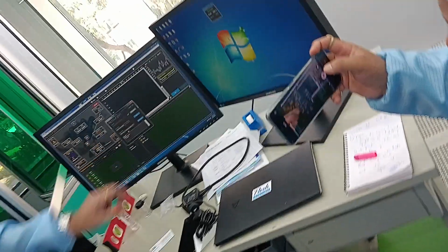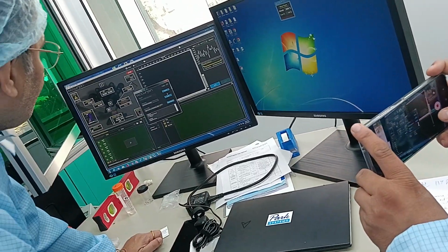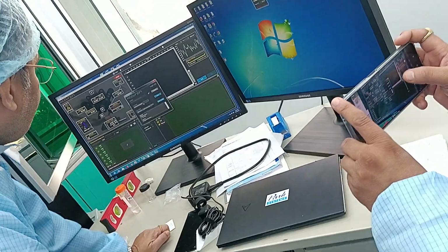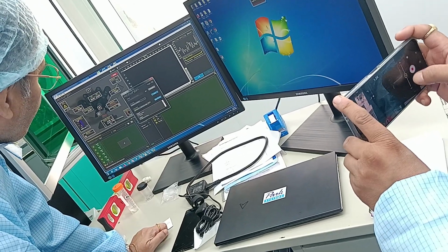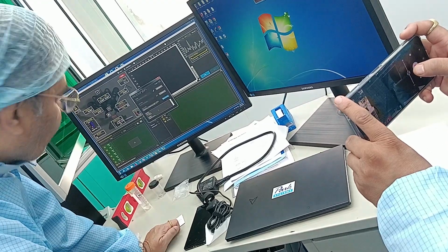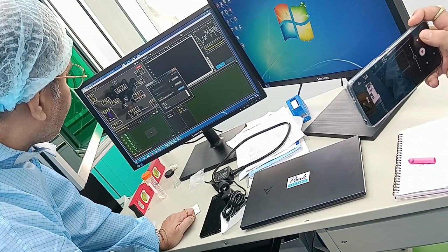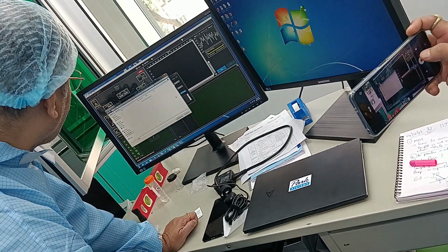Where you have a green module, you just say register. Then here I have given my name because I am operating. So what you have to do is I say login. You give your name, and it will give an area where it is being logged. So I just click here.